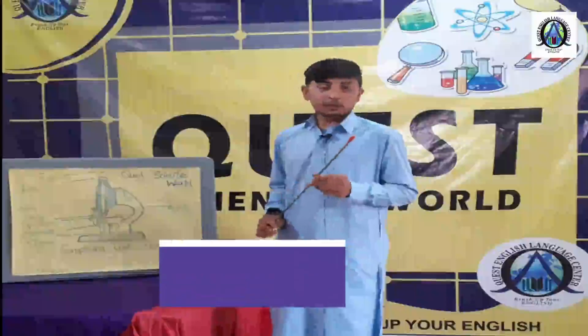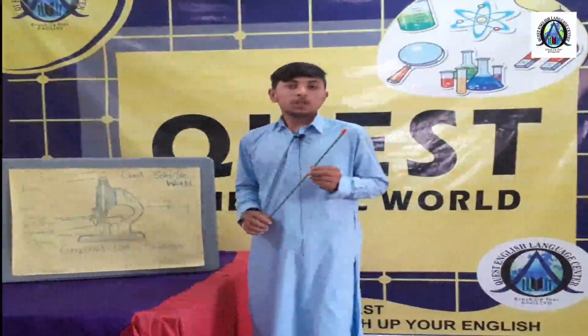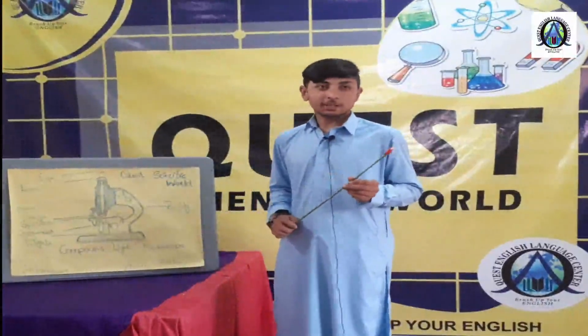Today I'm going to explain my model, and I'm here with my model, which is about the compound light microscope. The reason why I selected the compound light microscope is that it is very beneficial and helpful for our modern science and technology.